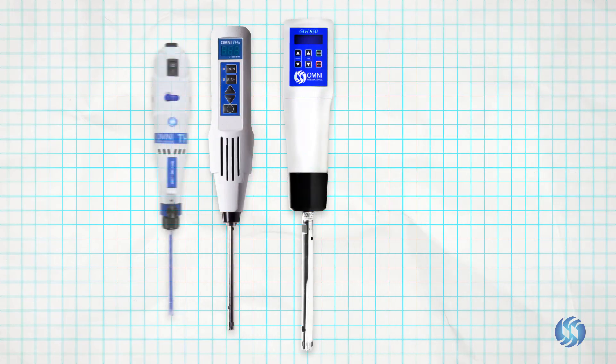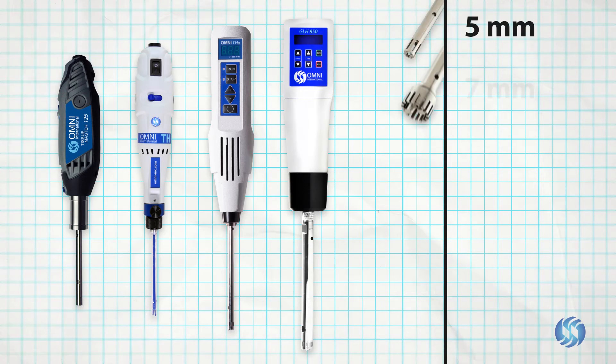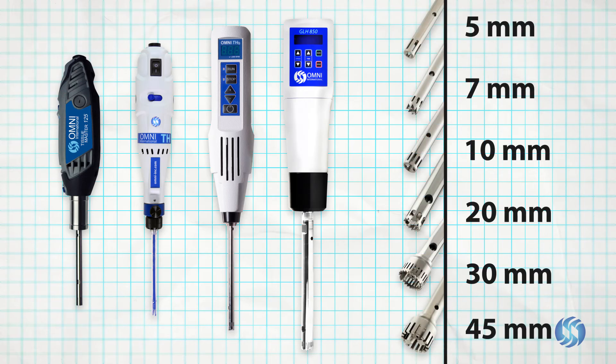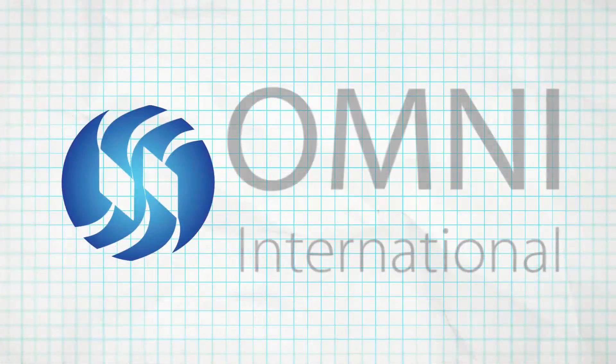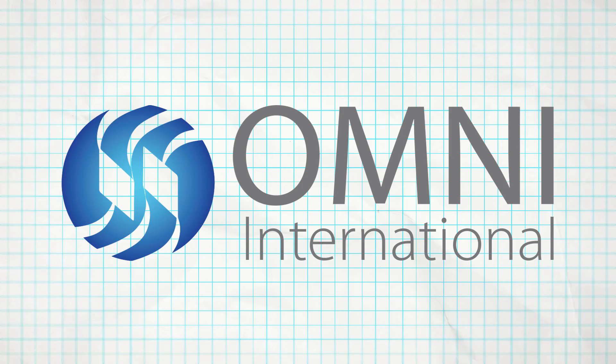Omni International offers a wide range of rotor stator homogenizers and accessories to support any application. With over 60 years of homogenizer expertise, the Omni team can help you identify the perfect combination for your lab.